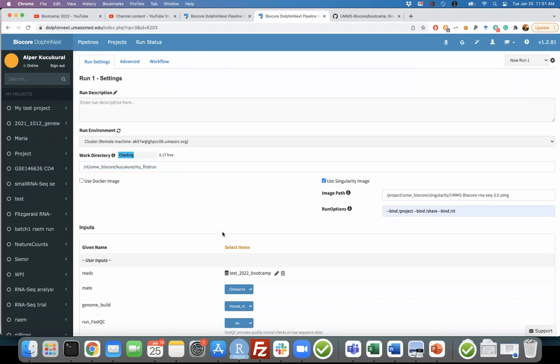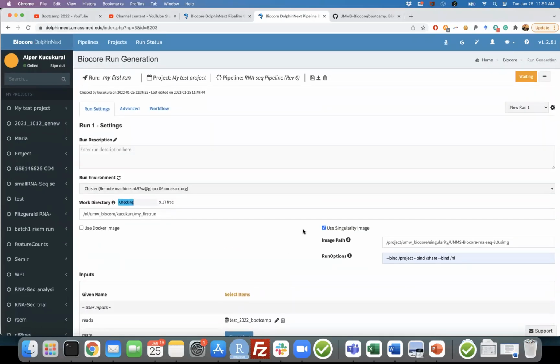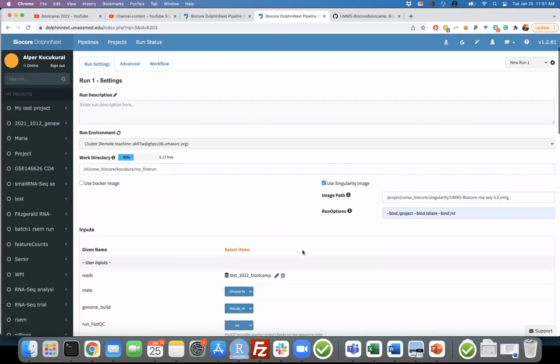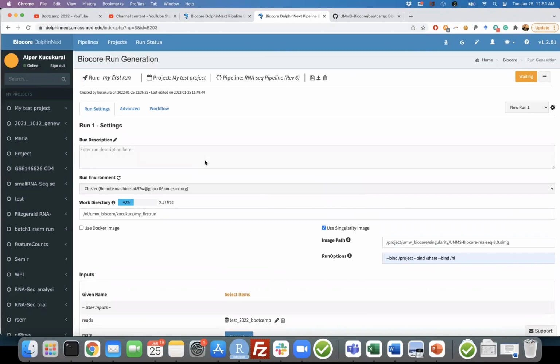You can remove some of the intermediate files you're not going to use, because keeping your original files and rerunning will be much easier. Everything to create intermediate files, BAM files, and everything in the future, because you're going to see this run will finish in 4 hours, for example. But again, space is so expensive, so make sure that you don't keep all these intermediate files. Remove them, but run when you need it. Again, you can always rerun these things.